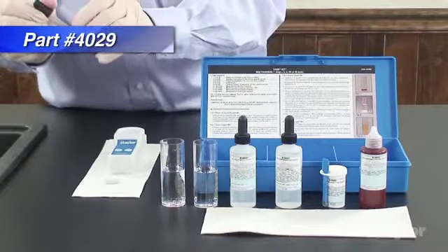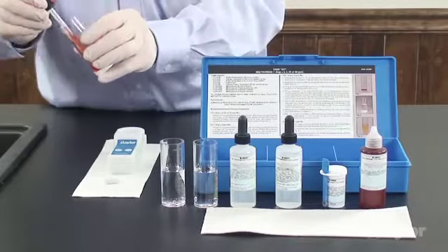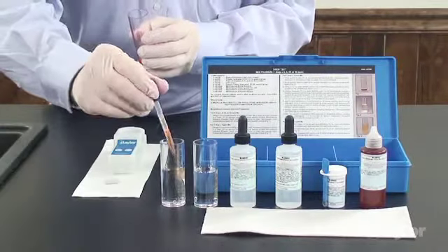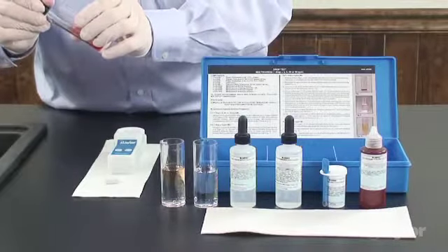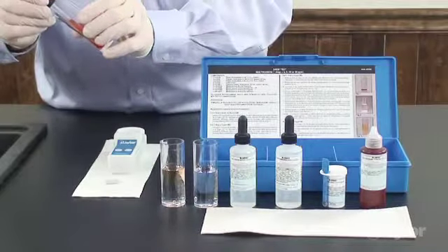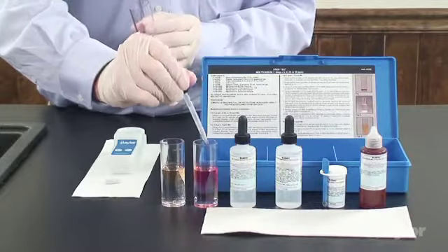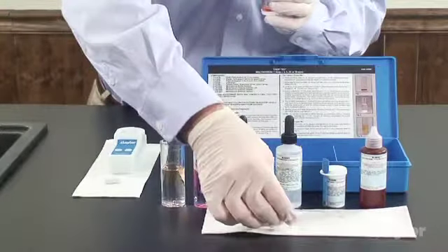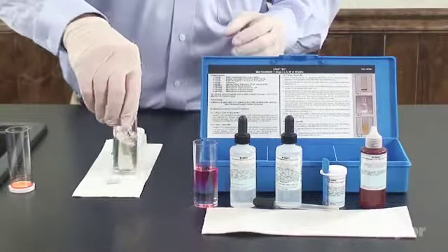Using a separate 1 milliliter pipette, add 1 milliliter of the solvent powder mixture to each sample tube, transferring as few undissolved crystals as possible. However, if transferred, crystals will not affect the test results. Swirl to mix.